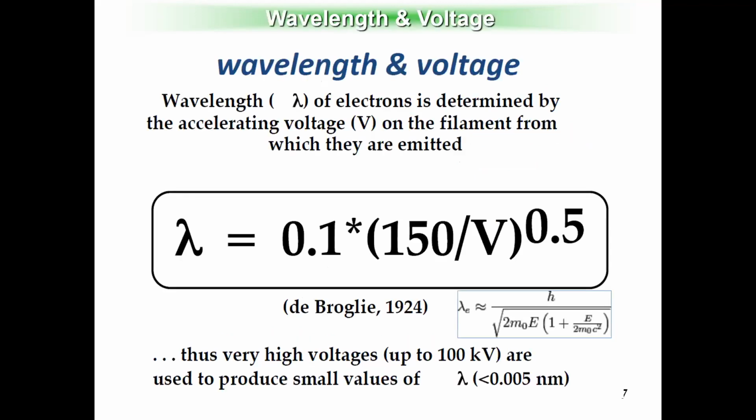And the resolution basically is controlled by your wavelengths, right? It's like the light microscope, where you cannot image something smaller than 100 nanometers, so it's relatively at the micrometer level. The reason that the electron microscope can give you sub-nanometer resolution is because the wavelengths of the electrons can be much smaller than visible light. And the reason for the smaller wavelengths is the accelerating voltage, right?